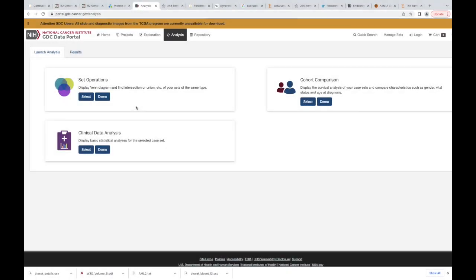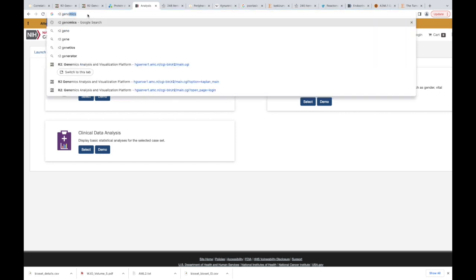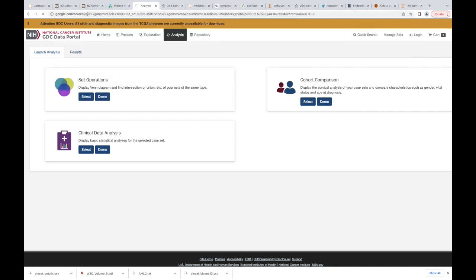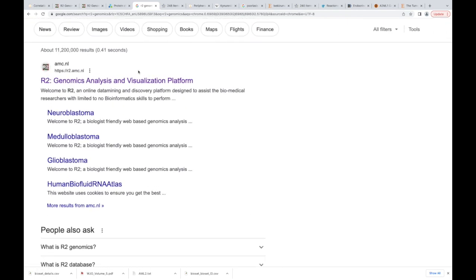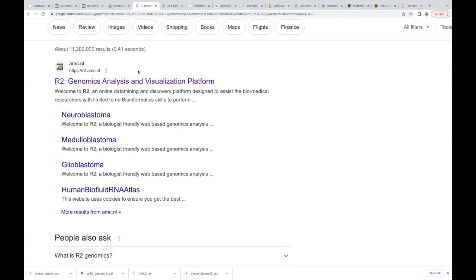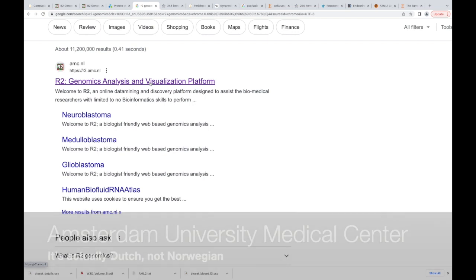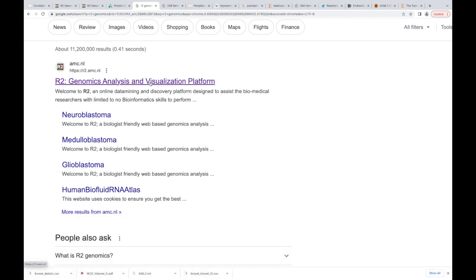So here is where we are going to go. What I want you to do is in your URL, type R2 genomics. Hit return.